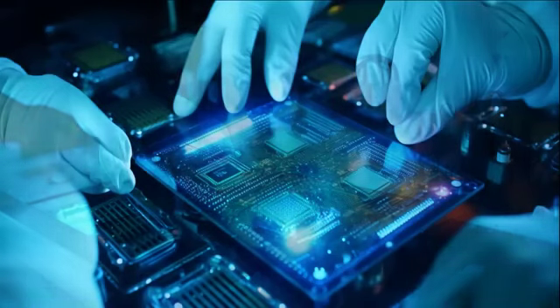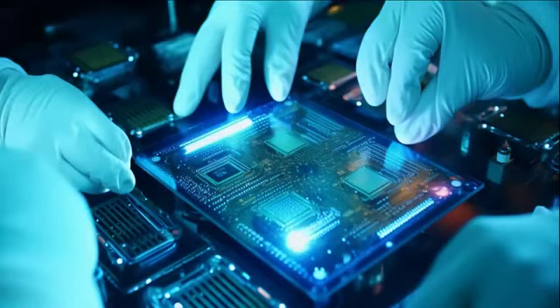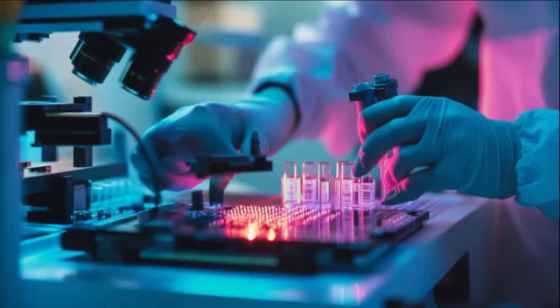Microfluidic logic circuits are emerging as a way to process information directly on a lab-on-a-chip device without external computers. For instance, fluidic logic gates can control reagent flow based on input signals, much like electronic circuits in a computer process digital information to produce a desired output. Lab-on-a-chip technology is making its way into wearable devices for continuous health monitoring. For example, a wearable chip can analyze sweat for biomarkers related to hydration and stress, much like a fitness tracker continuously monitors your heart rate and activity levels to provide personalized feedback.